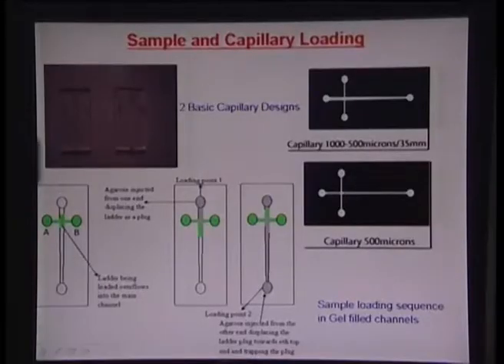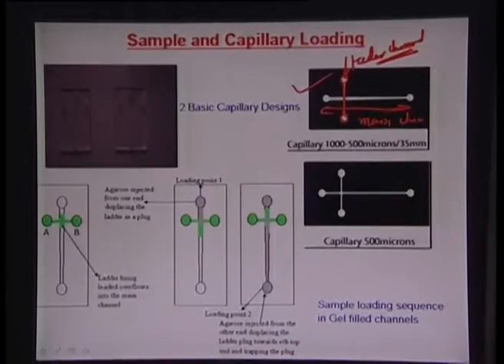So what this really means is that you can take it onto a small capillary. This right here is an illustration of what capillary electrophoresis can do. So this is a mask of a capillary system. Here you see a set of crisscrossing channels. This is the feeder channel, which you can also use for sample loading, and this is the main channel, which does the electrophoresis.